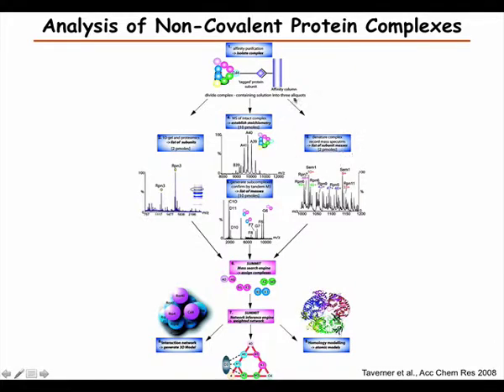So the third thing we can do is to partially denature the complex in solution before we do mass spectrometry. And there we actually have quite a lot more different options than what we have when we do the fragmentation in mass spectrometry, at least so far.